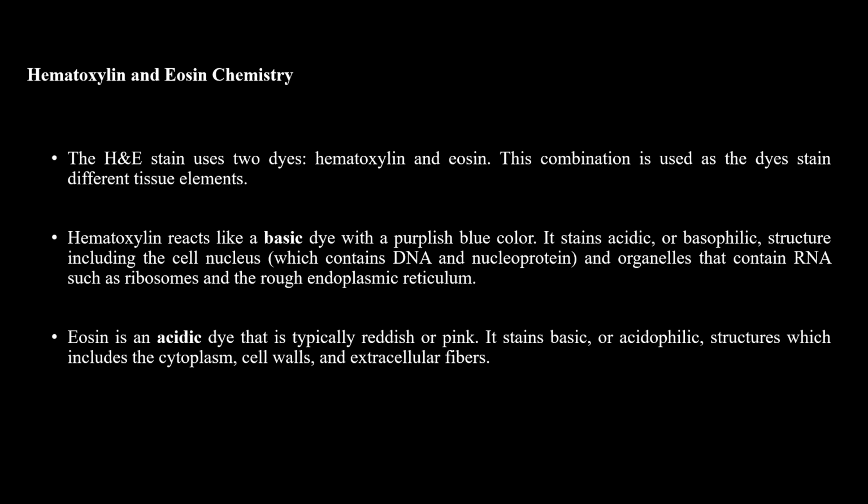Hematoxylin and eosin chemistry. H and E stain uses hematoxylin and eosin. The combination uses dyes to stain different tissue elements.